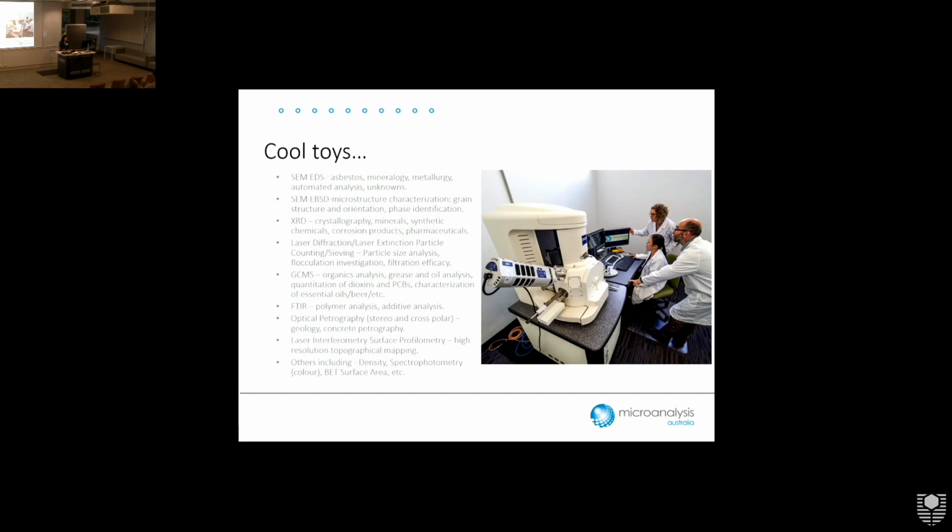We also have Rick's favorite laser diffraction, the old Malvern 2000, which has travelled from his backyard all the way to off-site and back again. So we did lose it momentarily, on its way back from an oil rig, and it was lost for a week. They said, oh, I don't know, the shipping thing says it should be at your lab. It's like, well, it's not here.